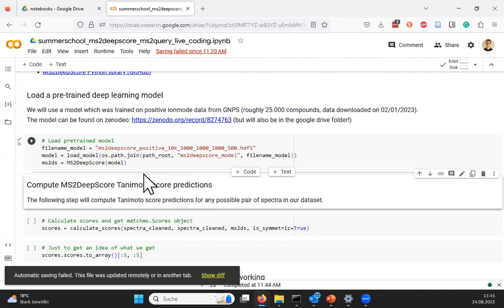But even if it doesn't work for you, so if you have no files, or the file upload is slow, in the Google Drive there's also a solution of this notebook provided. So I think it should be fairly simple afterwards to also go back and check this again.